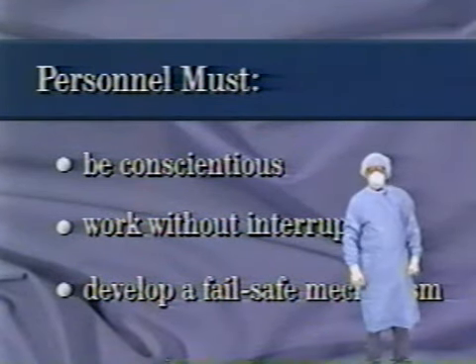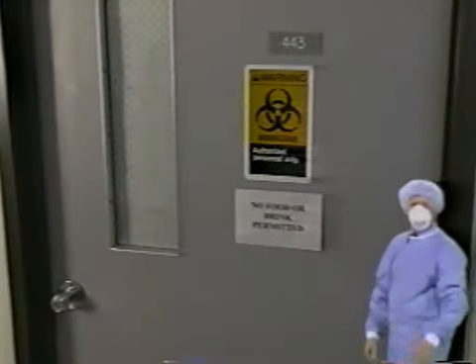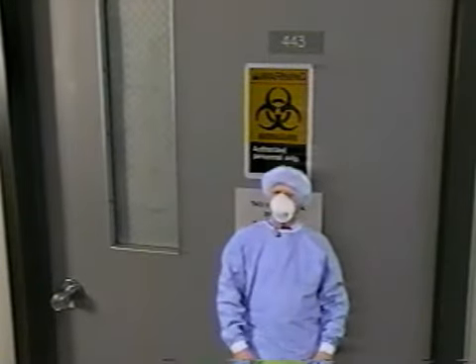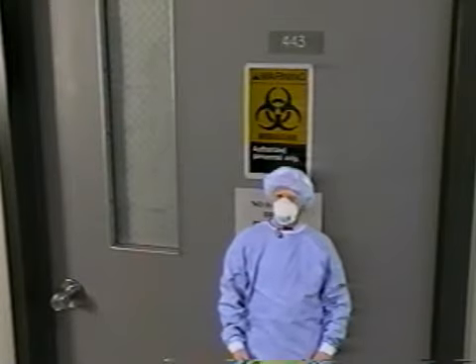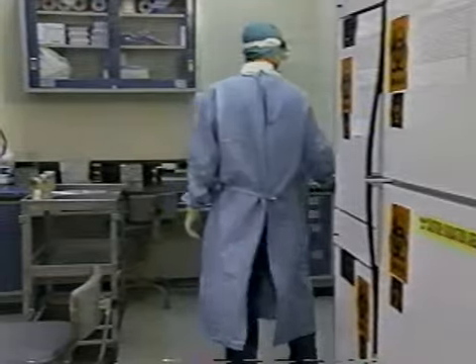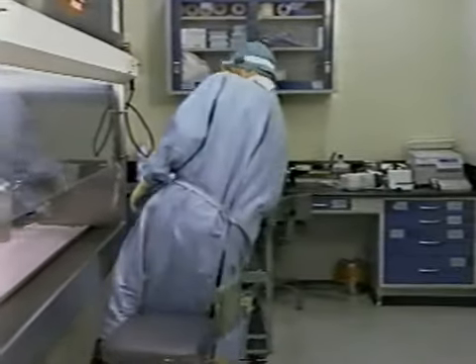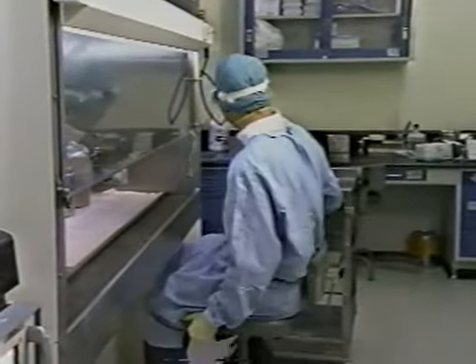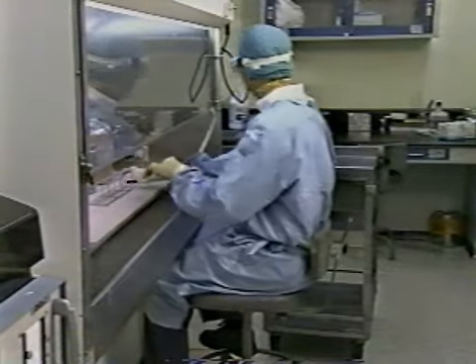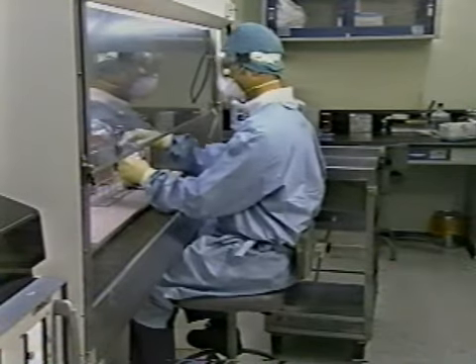Now let's look at the next step, specimen processing. It is critical that when processing specimens, the laboratory area is restricted. Personnel must be trained and know how to perform tasks safely. They must be able to recognize conditions that lead to cross-contamination of samples or infection of workers. Universal precautions must be taken, and personal protective equipment must be worn. It is essential that specimens be processed in the biological safety cabinet.